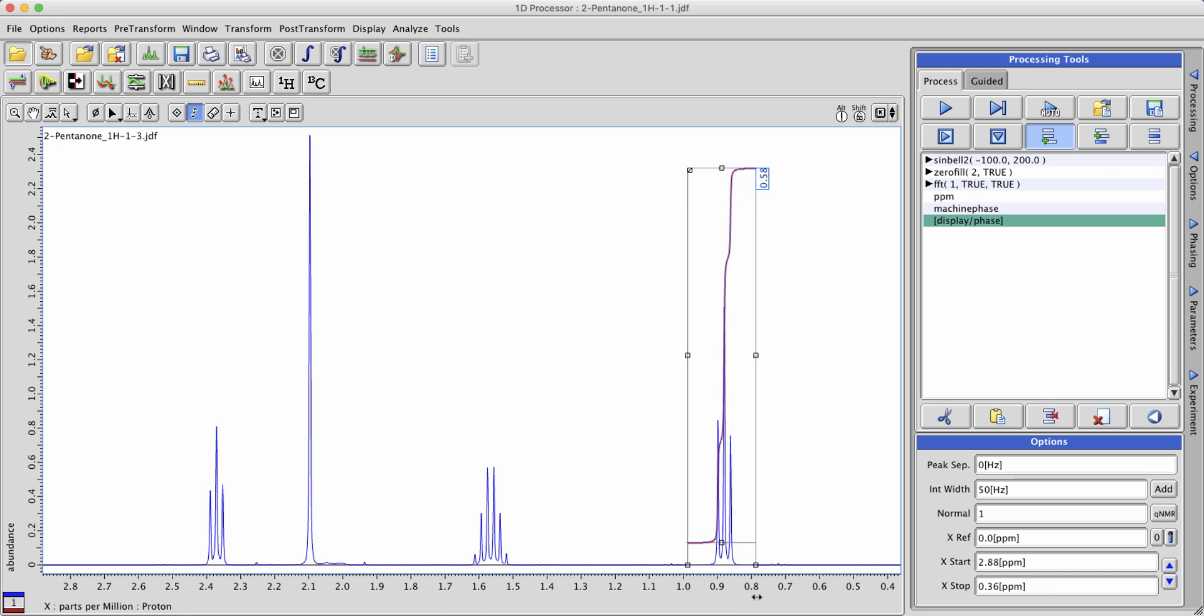The integral will be actually defined whenever you let go of the mouse button. So pay attention to the position of the cursor.